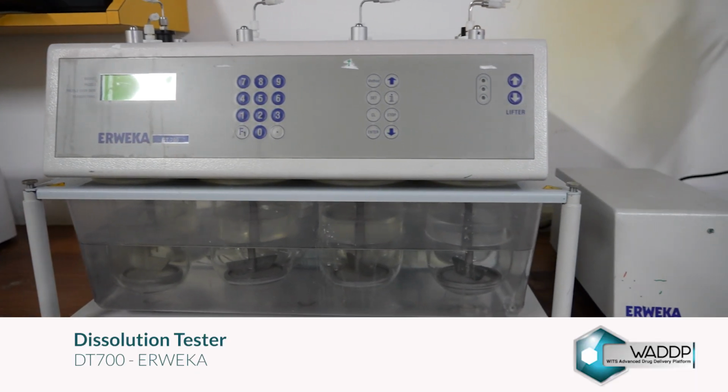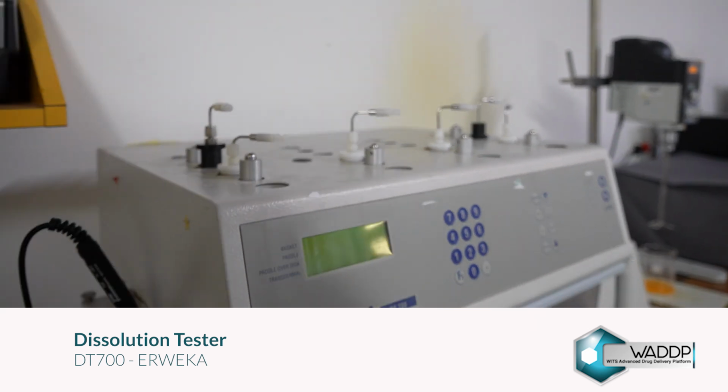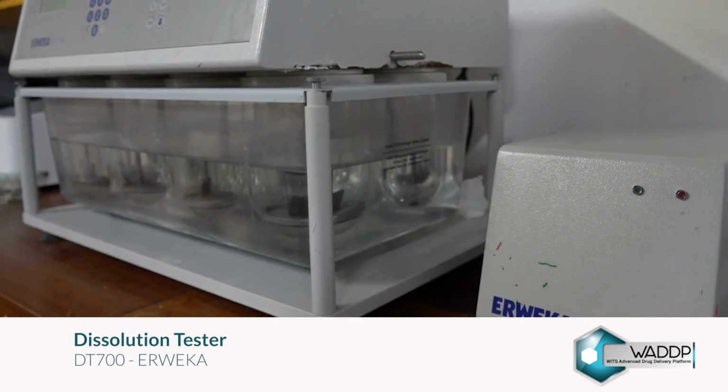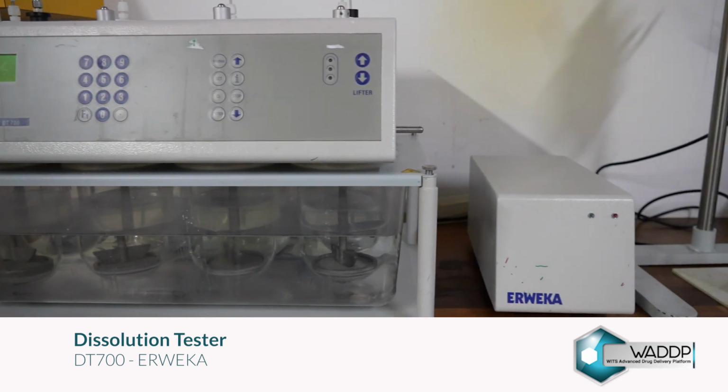A dissolution testing instrument used primarily in pharmaceutical laboratories for testing how quickly and how much of a drug is released from a solid dosage form, for example tablets, into a fluid medium under controlled conditions.